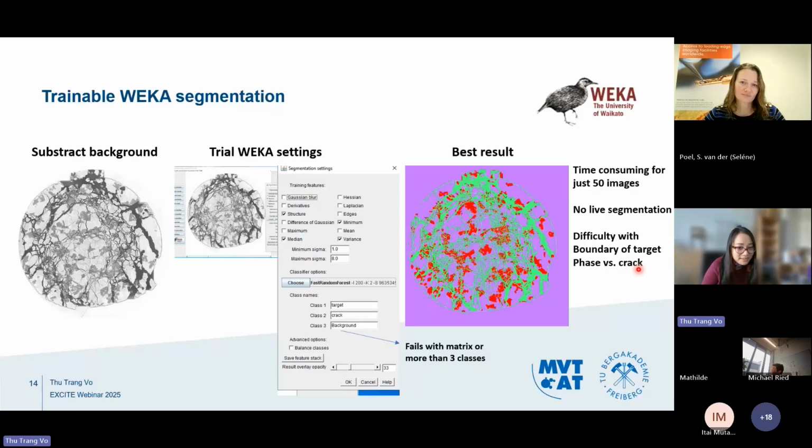And it has many segmentation options. Well, each option is very sensitive, by the way. It can change your image a lot. Although if you use the same settings on the same sample, it will give you the same result.